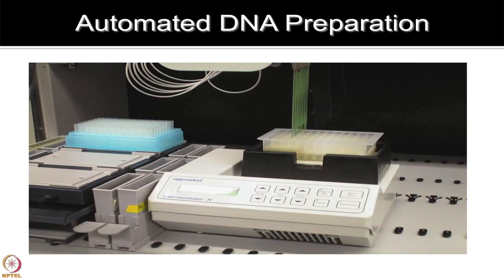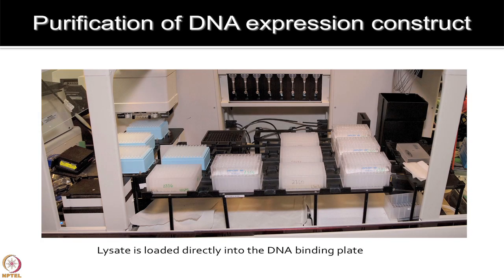Again, the setup for showing the automated DNA preparation. And now this particular liquid handler, which is very advanced, is used for the purification of DNA expression constructs.